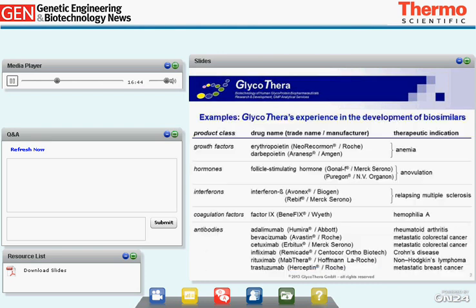This is a short extract of glycosylated biopharmaceuticals that have been analyzed in our laboratories. The variety of N-glycan structures to be analyzed range from highly sialylated, highly antennary structures, which, for example, can be found in erythropoietin and represent about 40% of the molecular weight of the total glycoprotein, to truncated neutral N-glycans, which are typically present in recombinant antibodies and correspond to approximately 2% of the molecular weight of the entire antibody.